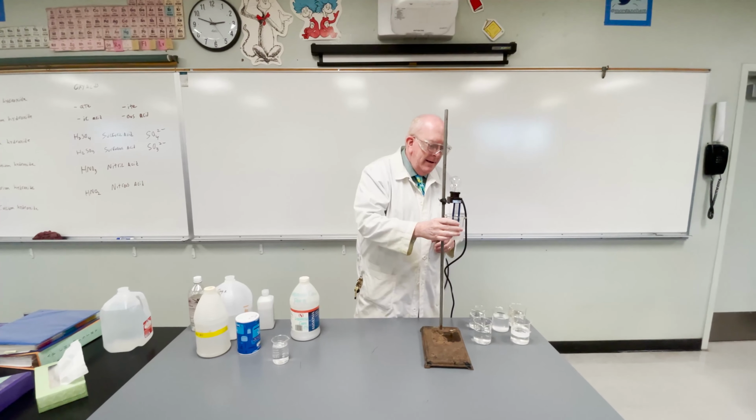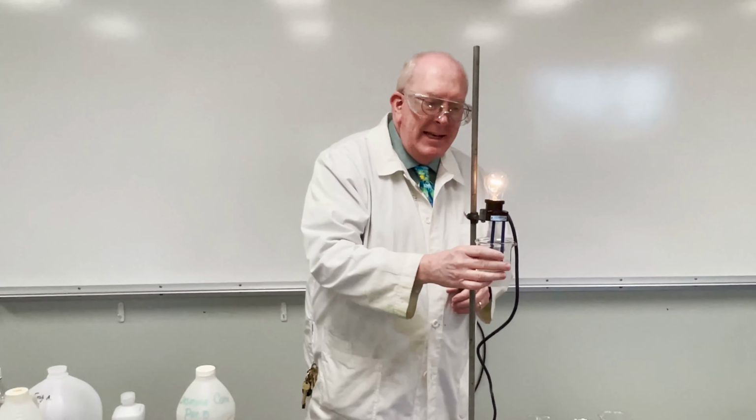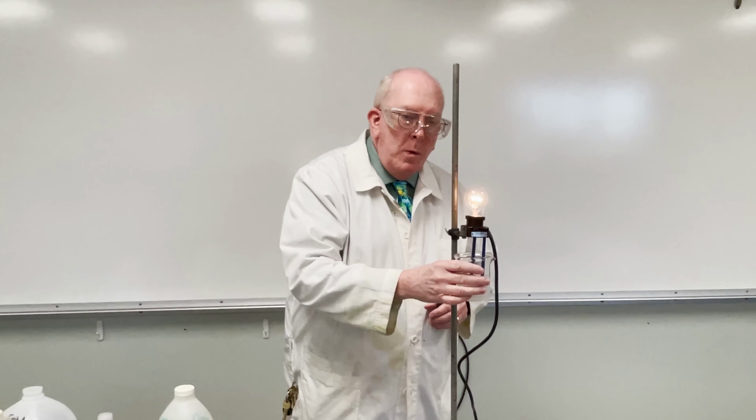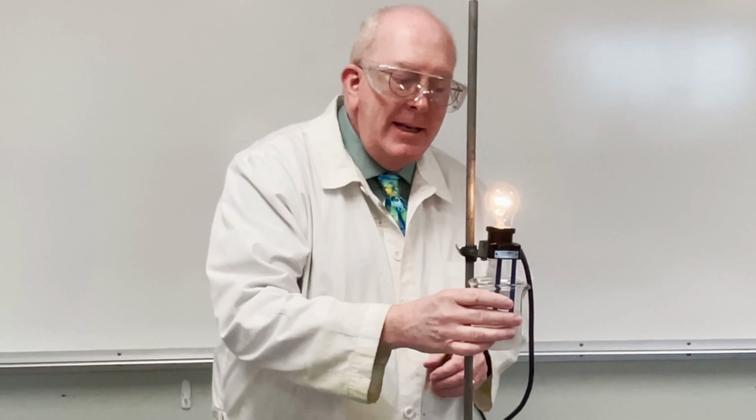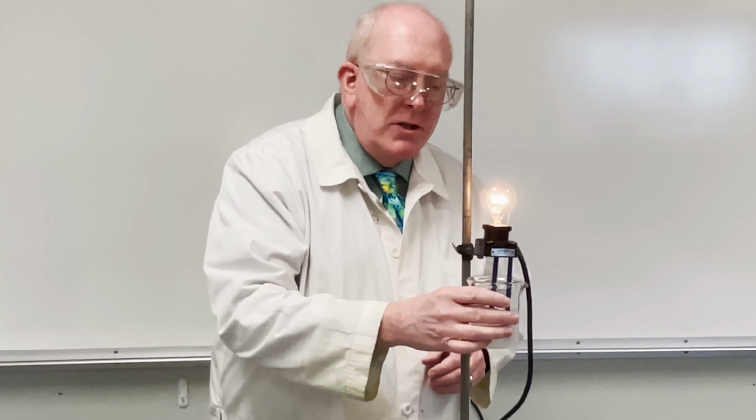Ammonia. Now, you're noticing it is also a weak electrolyte. It's a weak base. It's conducting, but it's doing a poor job of conducting the electricity through that.